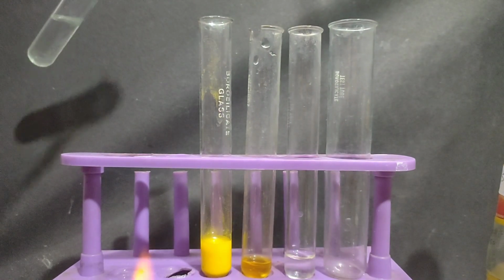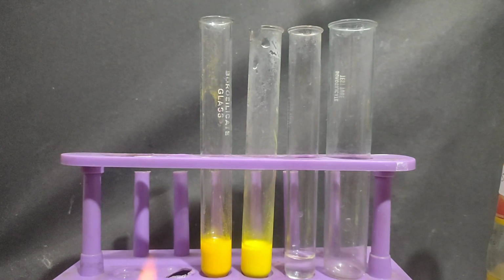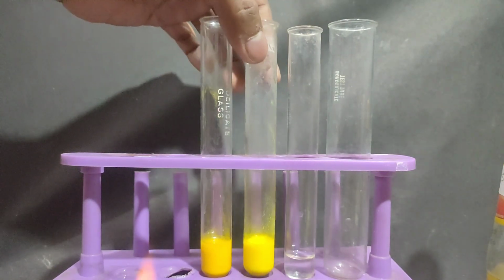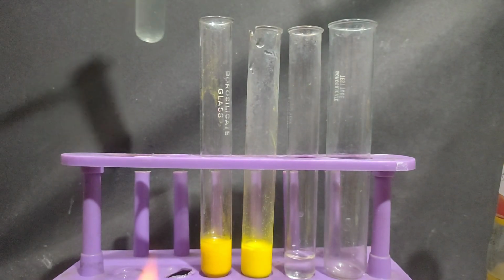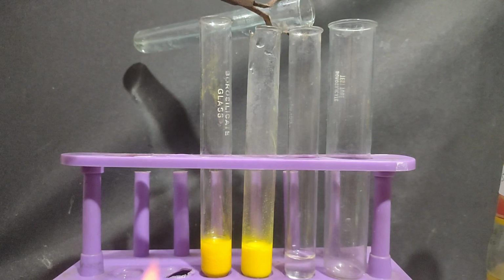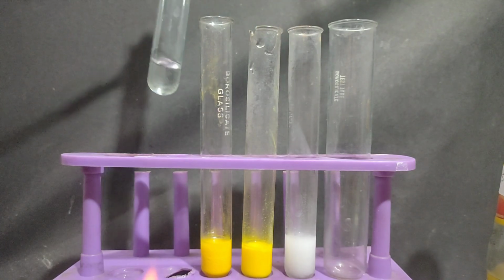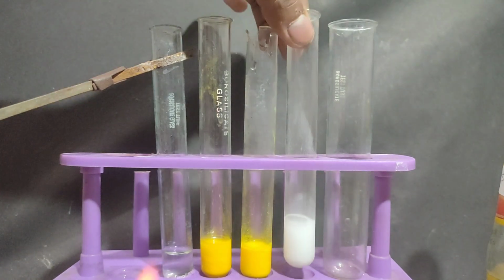Now I'll be adding this into potassium chromate solution. You can see the observation of a yellow color precipitate, but in this case the yellow color is different. Now I'll be adding this into dilute sulfuric acid solution, and you can see the observation of a white precipitate of lead sulfate.